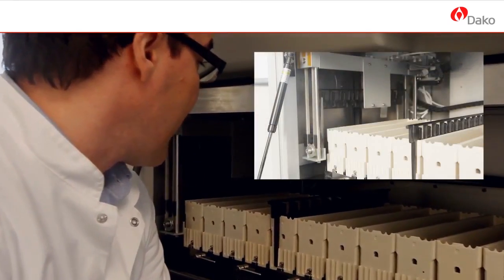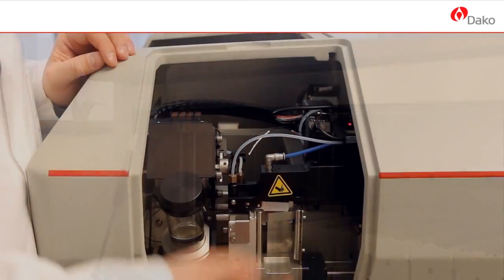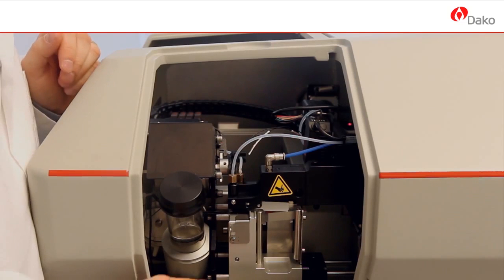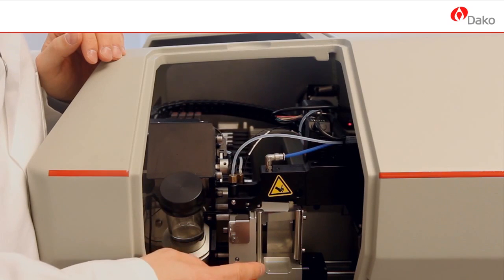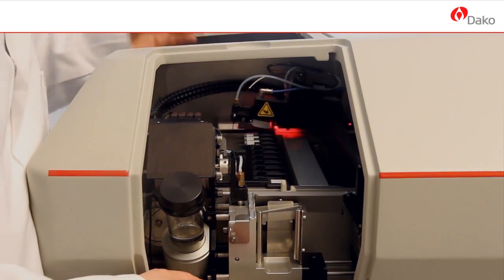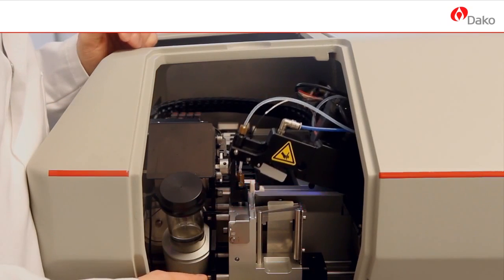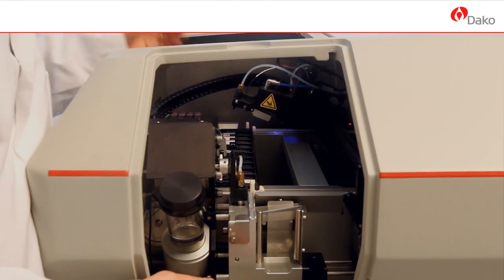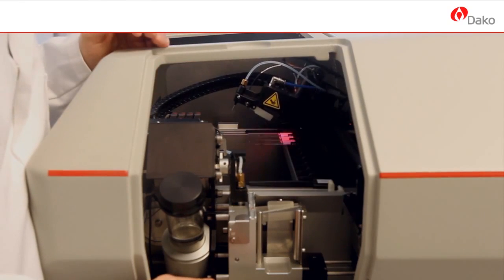The robot comes and picks up the slide rack, transfers it to the elevator that takes it up to the cover slipper. The cover slipper head picks up 1 cover glass, scans through to see where the slide is, and places the cover glass on the first slide. Then it goes back to the home position, picks up a new cover glass, and then goes to the next one and continues until the rack is completed.